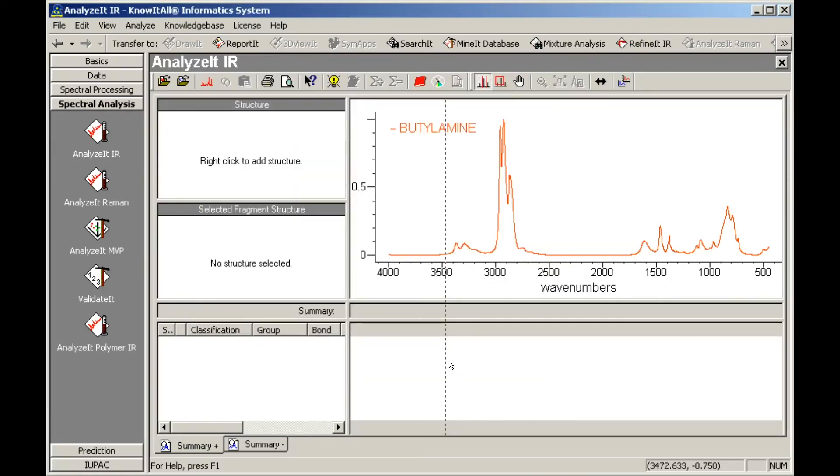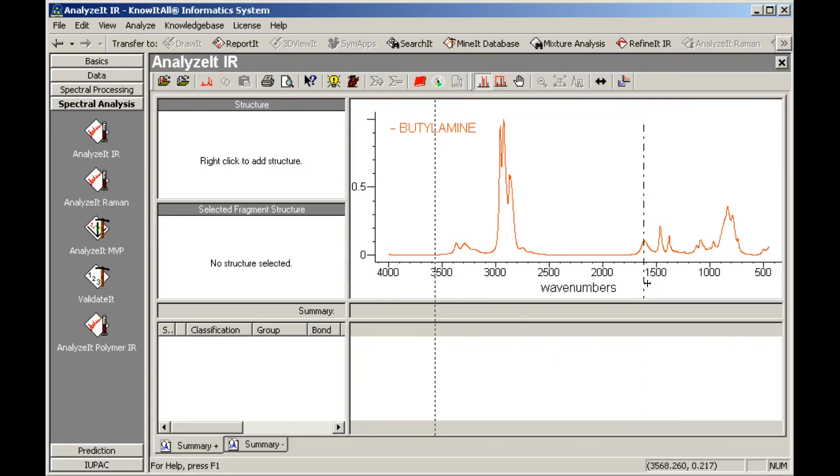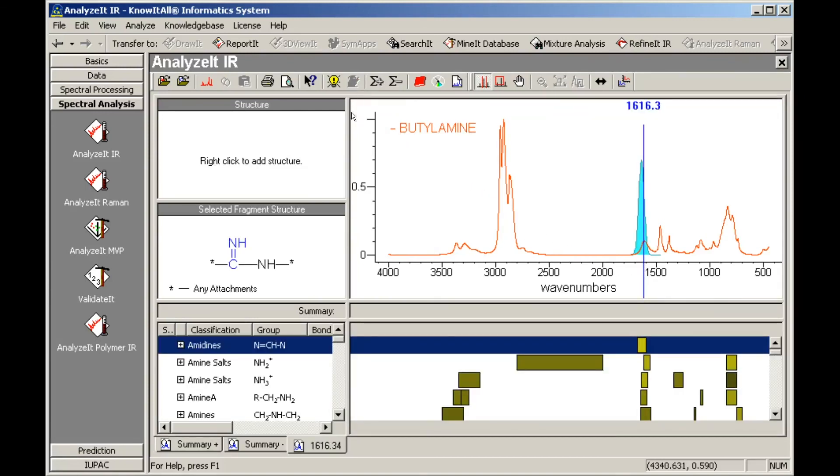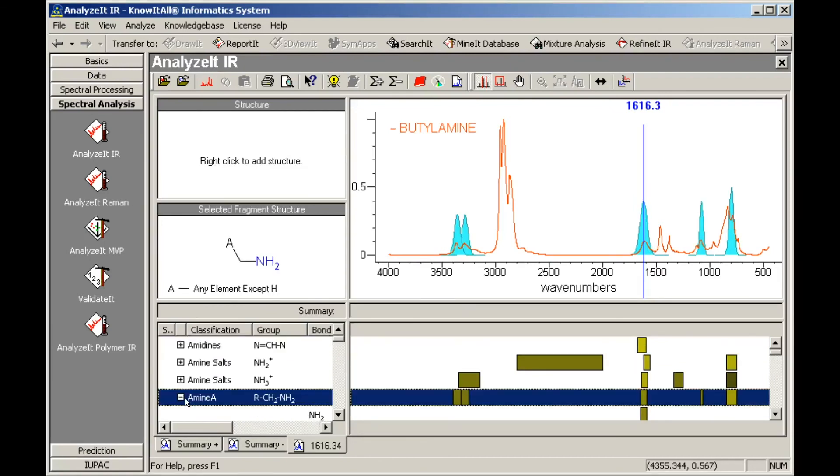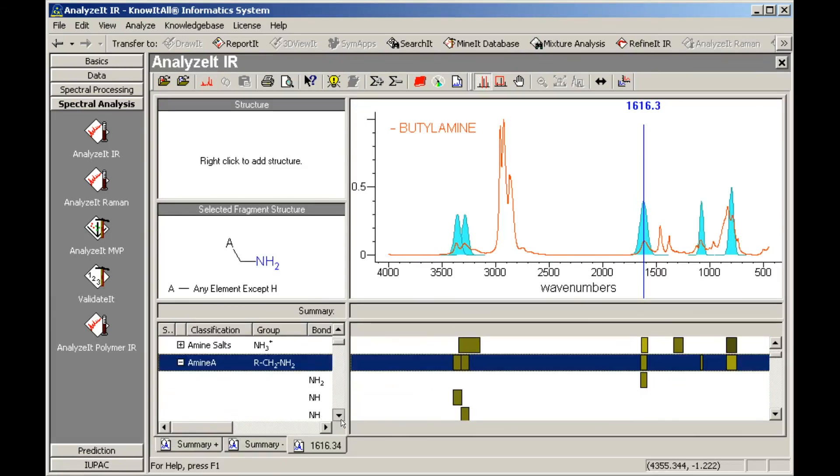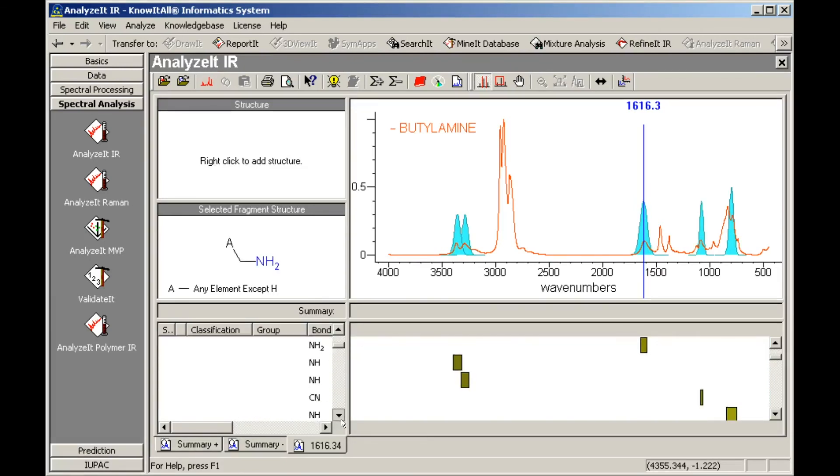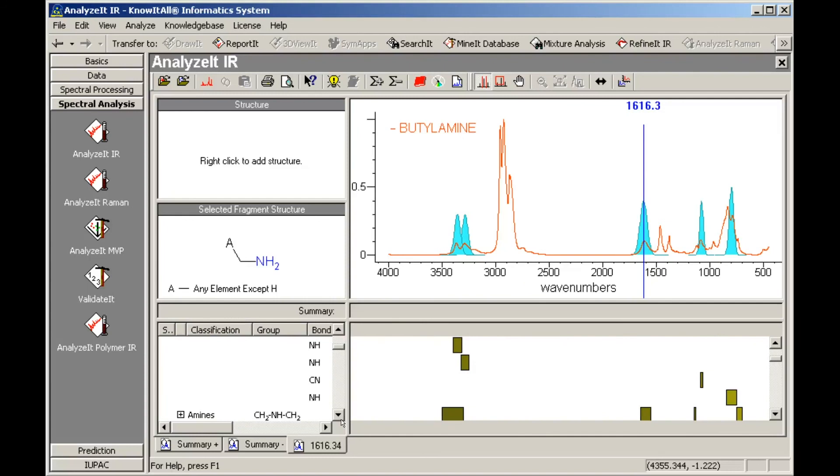Click on the peak around 1620 wavenumbers. Then, click the Correlate button on the toolbar. We see that the bands we added to the amine A classification in our user knowledge base are displayed among the entries in the supplied knowledge base. Note that the knowledge bases supplied with Know-It-All cannot be edited.